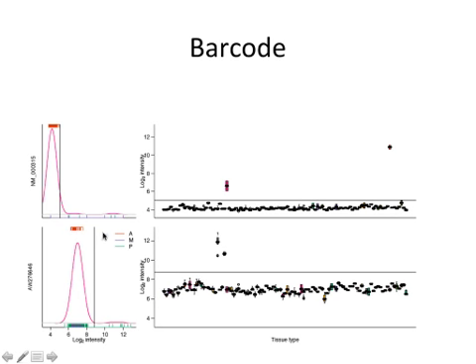I'm adding, this was in the previous picture, but I didn't explain it. The ticks, see these ticks? The orange ones are called absent by the manufacturer. The green ones are called present. That's their expressed, not expressed call. And M is for marginal, so they're not sure.